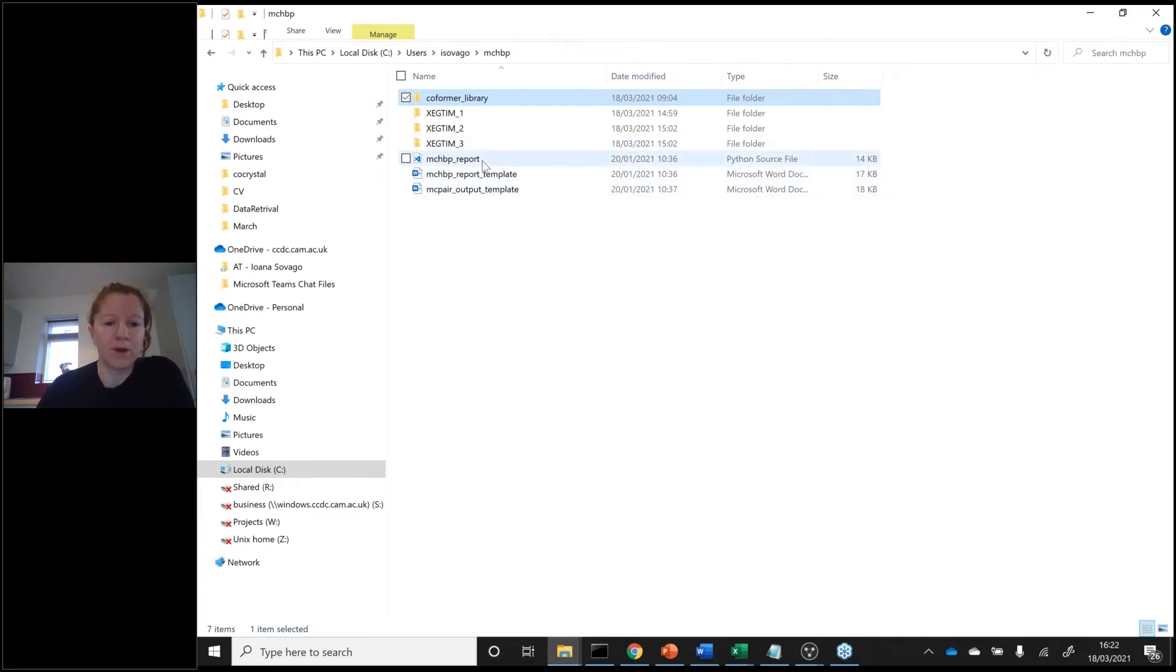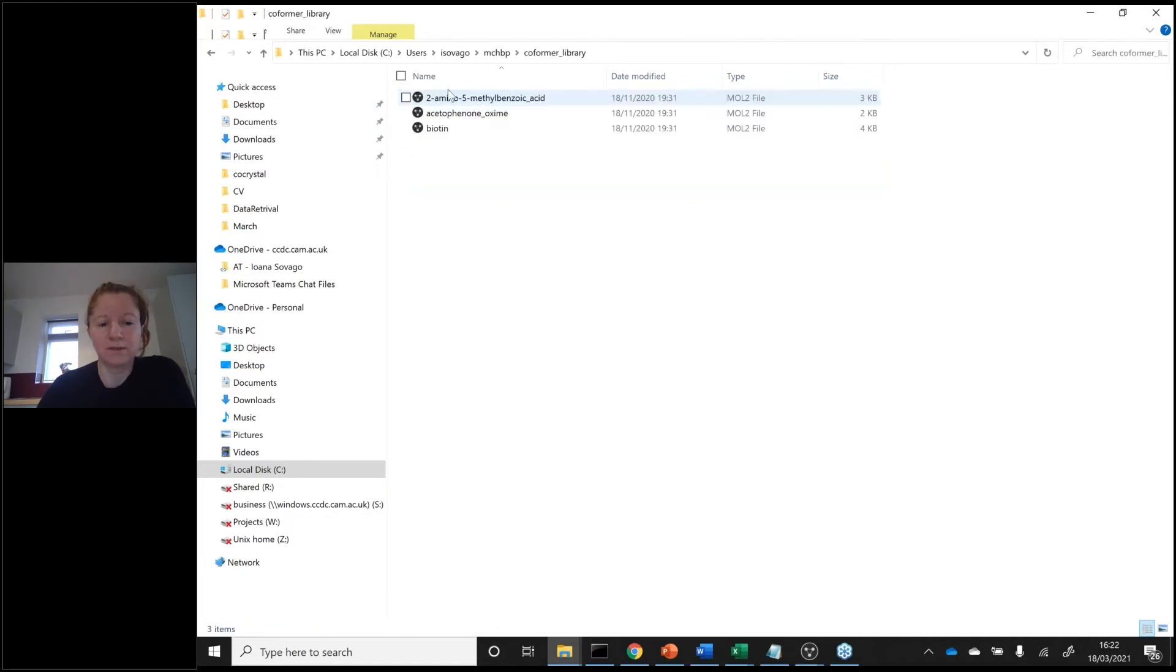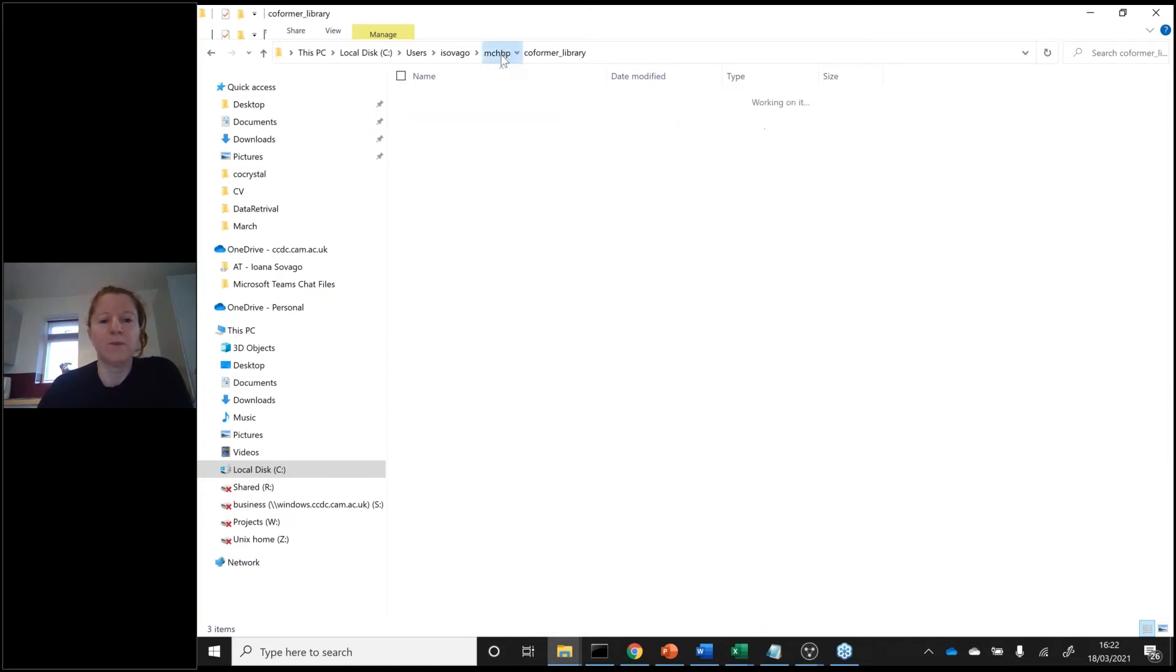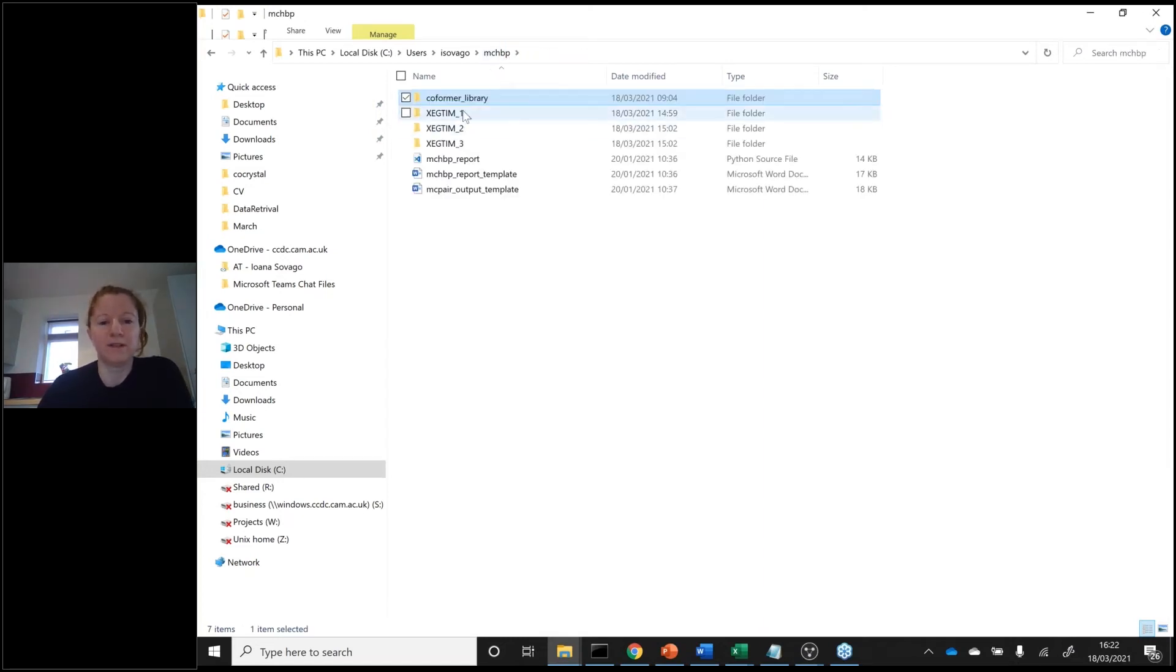You have to have all these three in your folder, and then you put your conformers. I just put three in this case. Once you run it, you will see folders like this with the results.